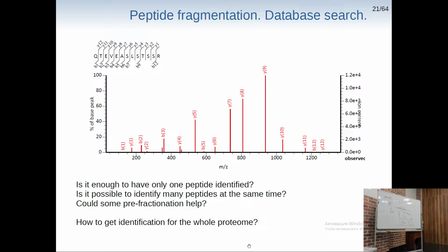But we need to discuss the following questions to be sure that we understand it. Is it enough to have only one peptide identified from your protein?